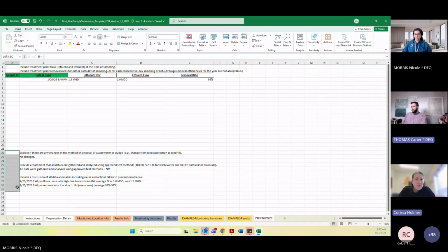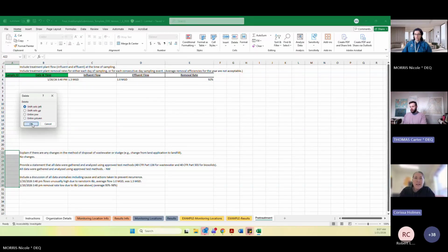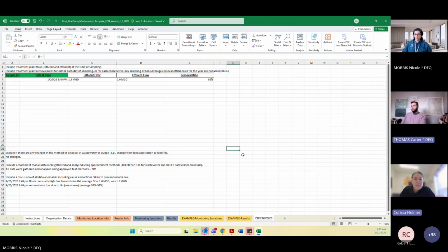Okay. So what I'm understanding is that you're pulling the removal rate for each sample that you have on the other results page. So for example, like copper, I'm going to have that for 3 days. So do you want this represented for like 3 data points, or do you want them averaged? And then I have a QA/QC day that's on my middle day.